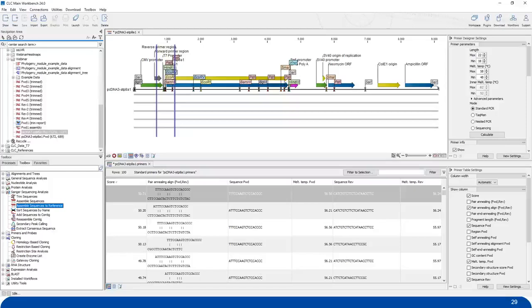Yeah, so from my experience, users that are working with CRISPR typically utilize the tools that are found with the upgraded version of the main workbench, which is the Genomics Workbench. That one is awesome at handling NGS data, and it does provide you with some awesome tools to take a look at that CRISPR data.